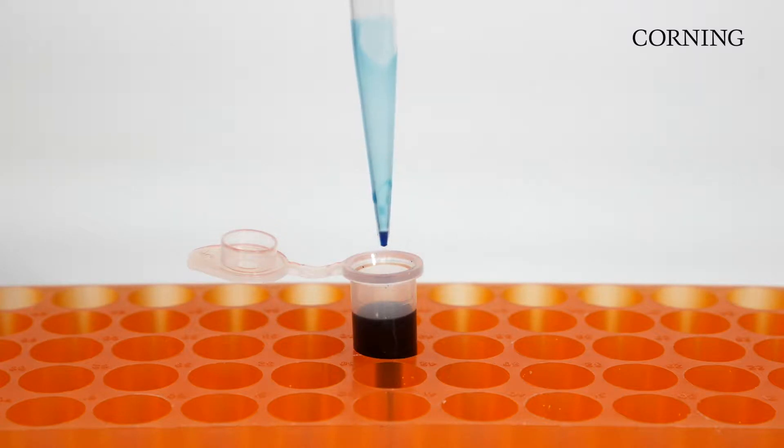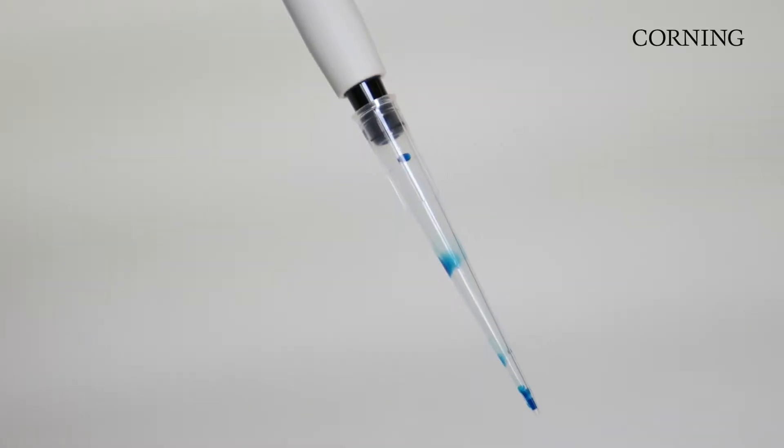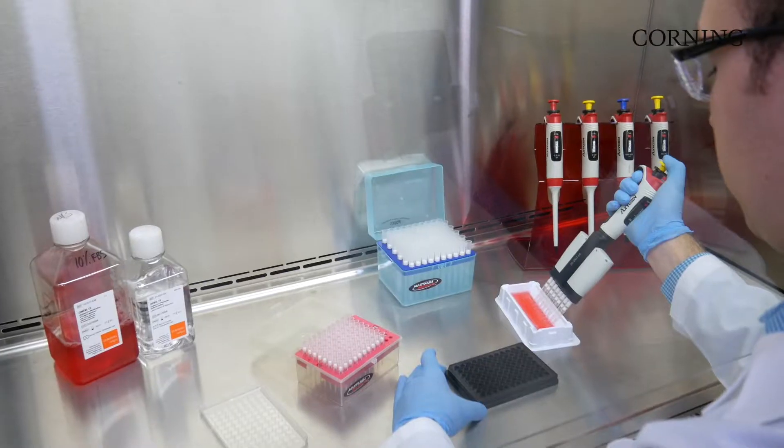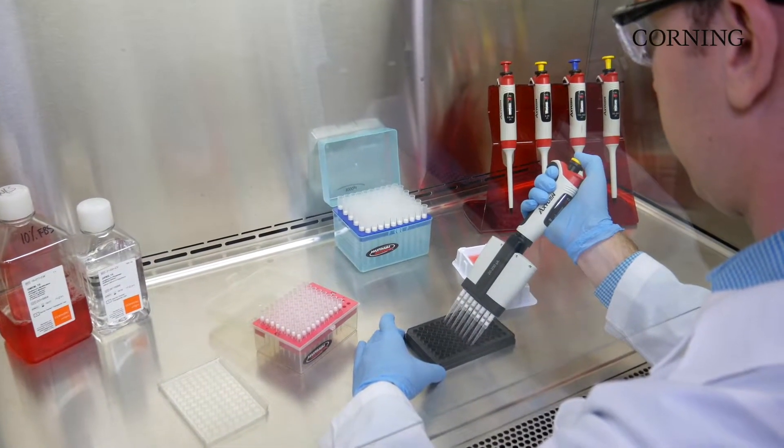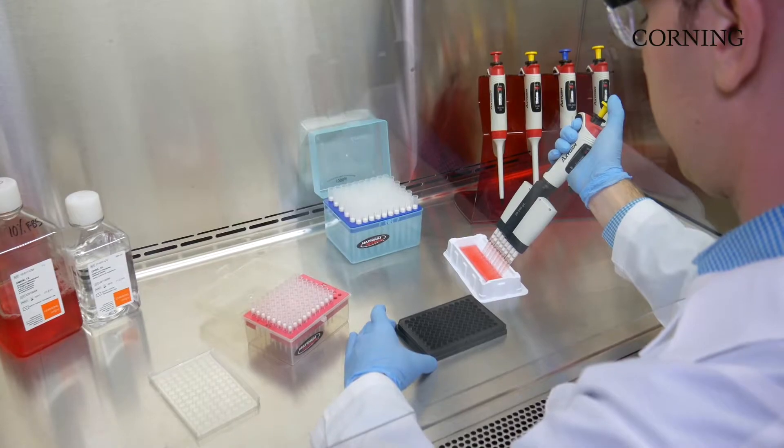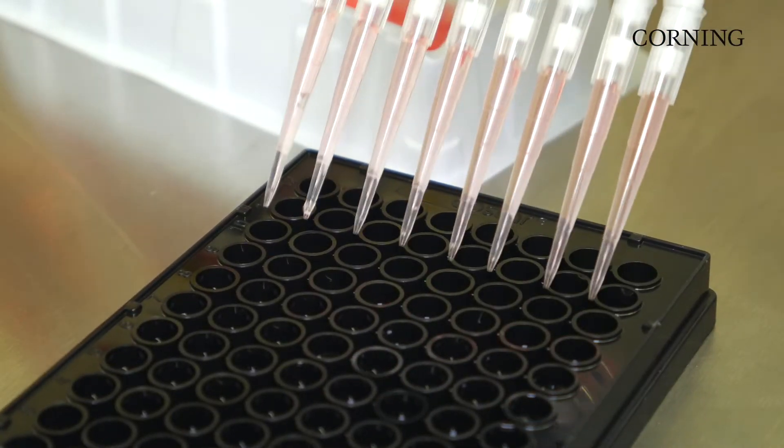Have you ever been concerned about the amount of liquid residue trapped inside of a pipette tip? Liquid binding on pipette tips causes loss of expensive or precious sample material and inaccurate pipetting, potentially affecting your research results.